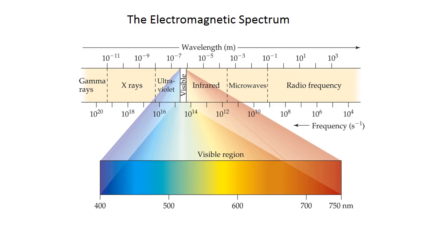Now, light that comes from the sun is considered white light. So that's basically all of the visible light together. Of course, there's also ultraviolet waves that come from the sun, but if we're only talking about visible light, then what comes from the sun is white light. So that's all the wavelengths mixed together. And we can use a diffraction grating, or the instrument itself can separate white light into different components, into the different colors. That's kind of like what the droplets of water do in a rainbow.